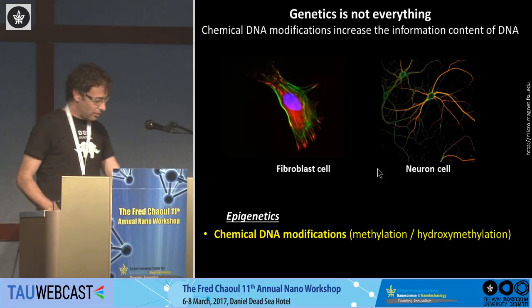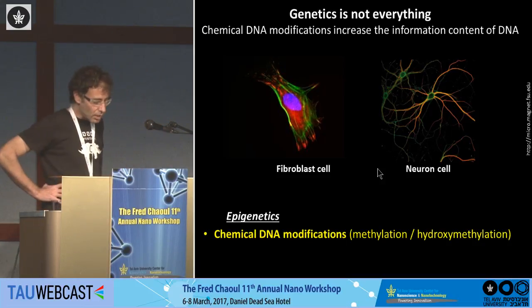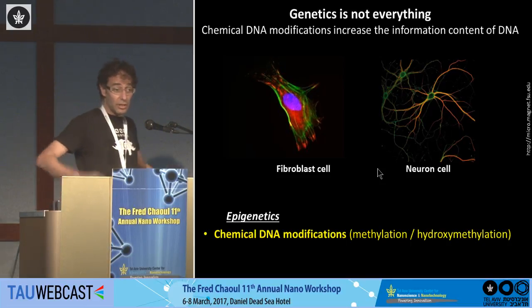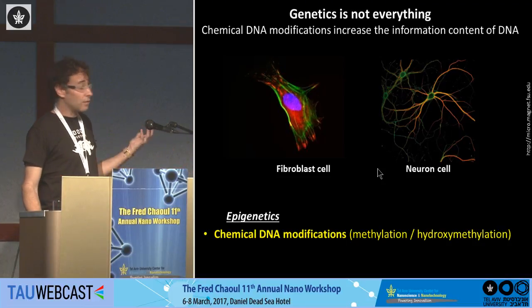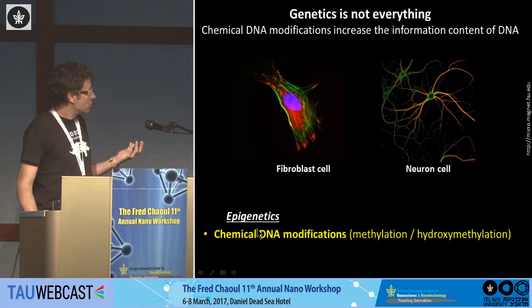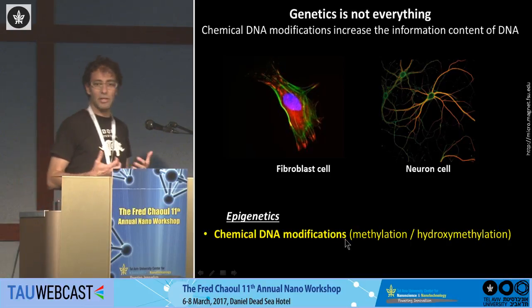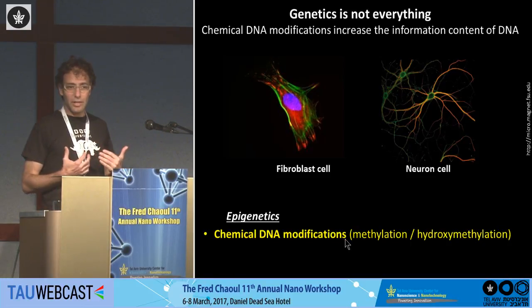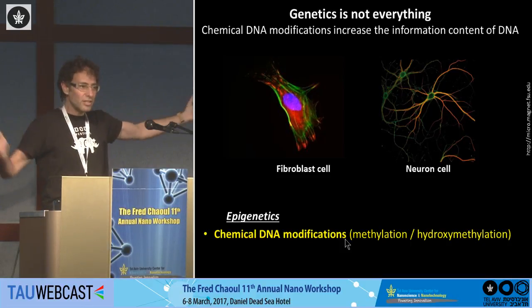Why is this useful? For the last minutes of my talk. Because we want to study information that is many times at very high resolution. And the most interesting thing for us to study is what is called epigenetics or chemical DNA modifications. Because each one of us has hundreds of cell types in his body, and they all carry his own genome. Exactly the same code, but they are extremely different.